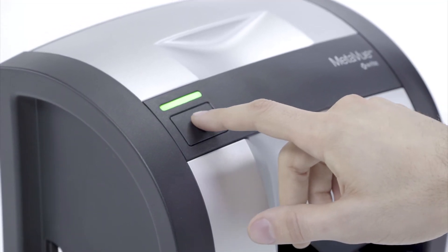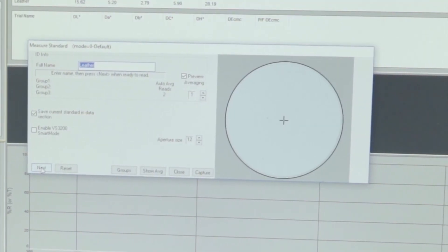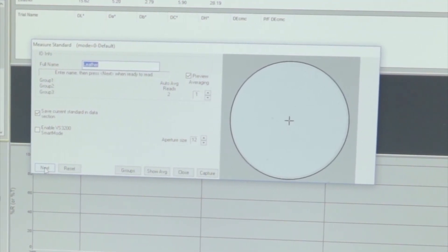Once the item is positioned correctly, initiate measurement by pressing one of the two measurement buttons, either on the top of the device or on the software screen.